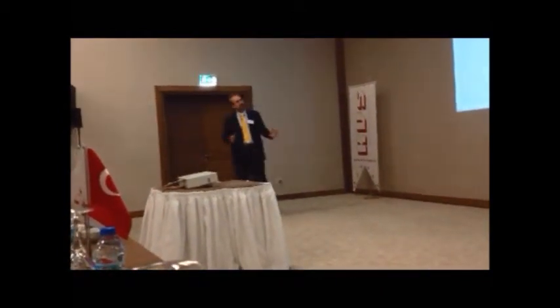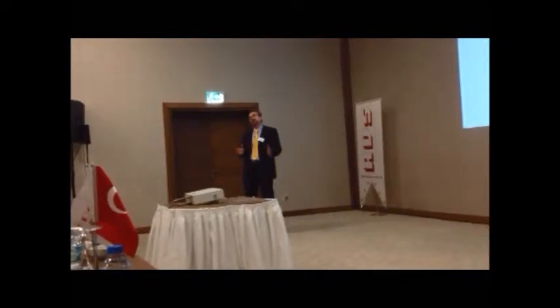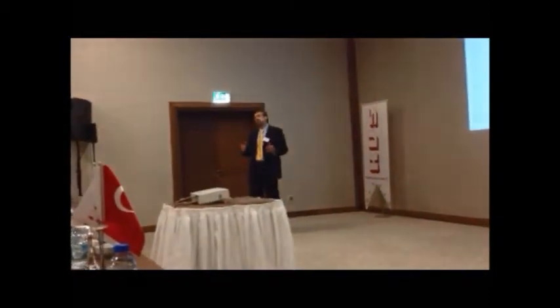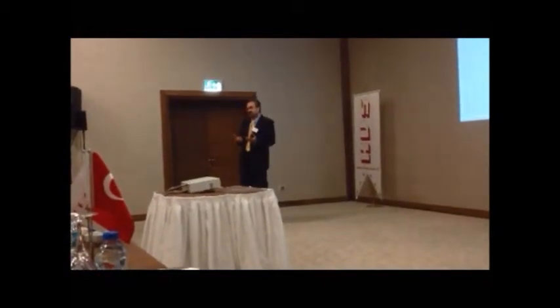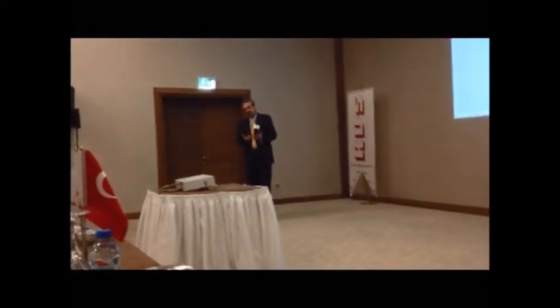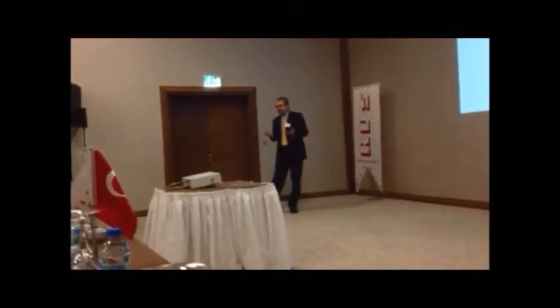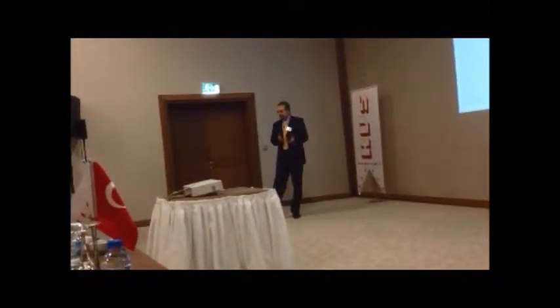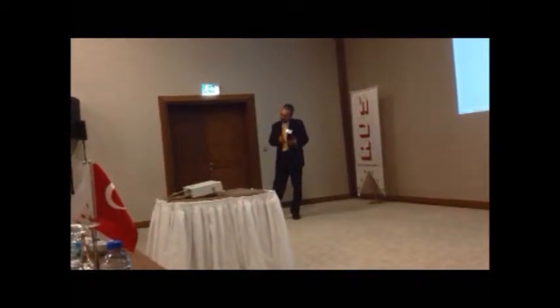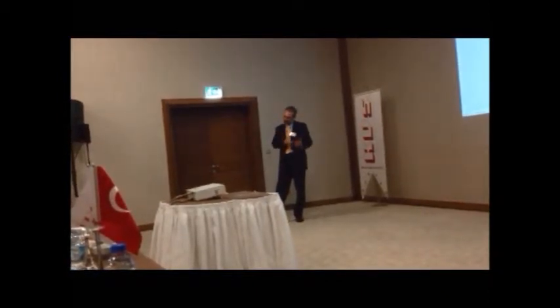And so we decide together what is necessary, because it's important also that the protocol is not so heavy. It's important to do the things that are really useful and that you really need. And this is related to the use of the autoclave and to the load, because again, I insist, validation is a process.